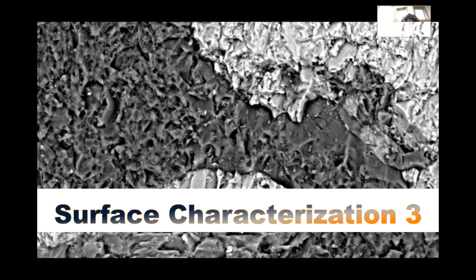All right, so if you took a couple of seconds to think about it, again, I think everyone so far has been a scanning electron micrograph. The last two lectures, I had that Mr. Clean Magic Eraser. And this is actually a rock, and it's a geological specimen. And it was made by a special flavor of electrons. And I thought I'd throw this in a little early because we've not gotten to SEM yet. But we're talking about another flavor of electrons today called Auger electrons.